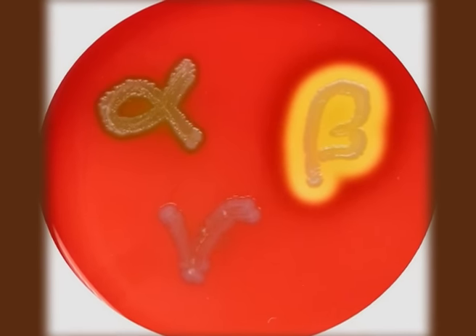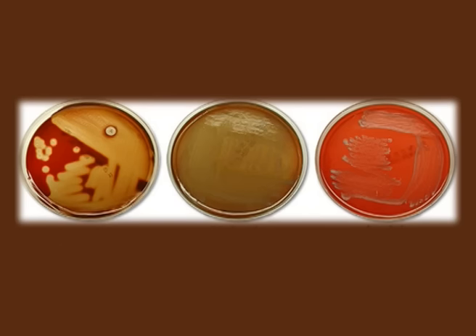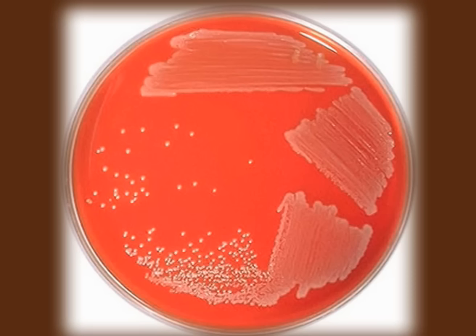This group of media can be used to differentiate between hemolytic and non-hemolytic groups of bacteria. Hemolytic bacteria are only able to grow with the help of nutrients supplied from the red blood cells. According to the type of hemolysis, bacteria can be differentiated into alpha hemolysis, beta hemolysis and gamma hemolysis. Generally, the strains of streptococci are grown in this differential blood agar medium.